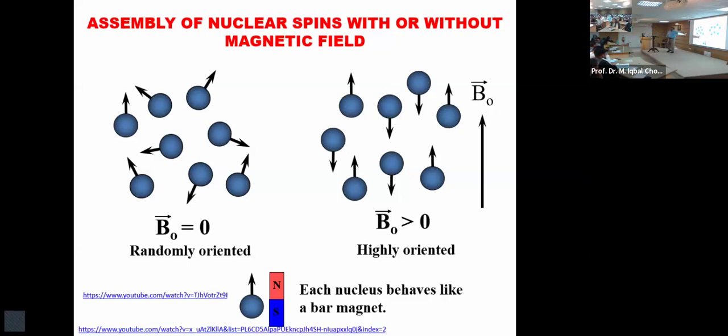this is exactly what happened in the 1940s when NMR spectroscopy was developed. This is the magic. What it means: certain nuclei are aligned to the magnetic field, they are in alpha state, whereas certain nuclei which are opposed to the magnetic field are in beta state. Now one is low energy, the other is high energy. The stage is set. This is exactly what you want for radio frequency to be absorbed.